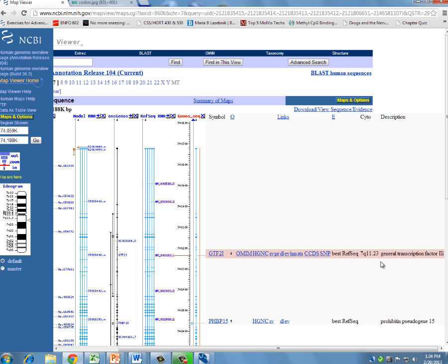So what we need to do for the lab report is copy this picture of the chromosome. It's showing you the chromosome itself and these bands, which are various bands on the chromosome, and your gene is located here. These bands are generated because of a special stain that can be used to color chromosomes, such as Giemsa stain, for example.